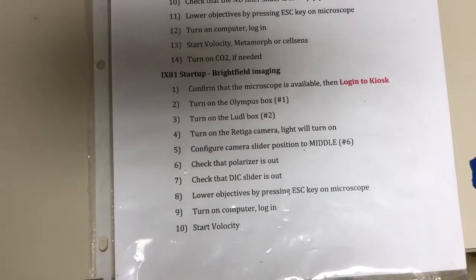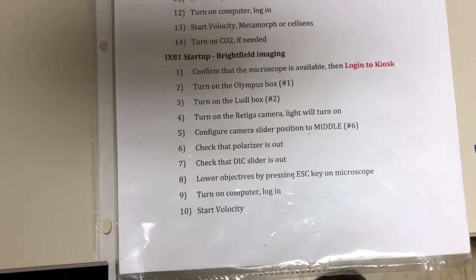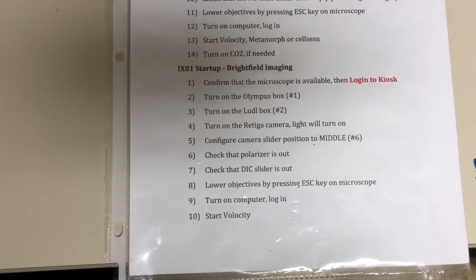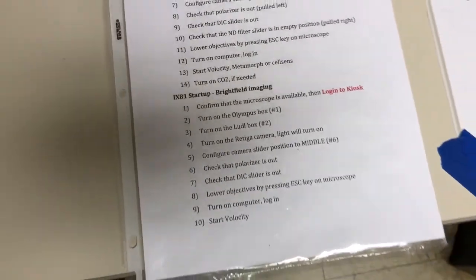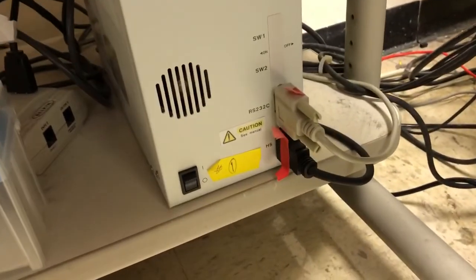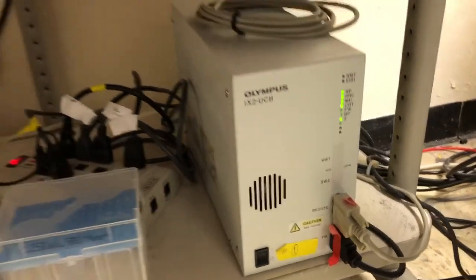The first step is to confirm that the microscope is available and log into the kiosk — I've already done that off the video. The second step is to turn on the Olympus box, which is item number one, down here. You can see the number one; we just need to turn it on. It'll make a bunch of noises and some lights will come on.